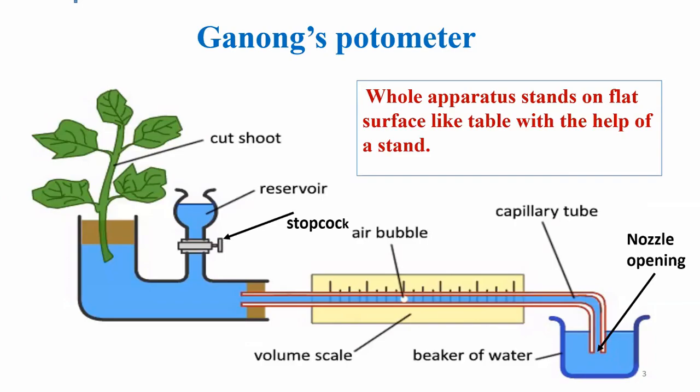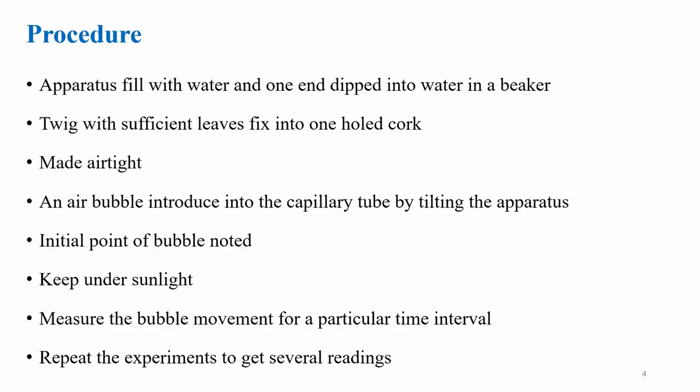Then the Ganong's potometer. Can anybody tell about the Ganong's potometer? How can you do this practical? Any idea? Okay, I'll put up the procedure. First you read and try to understand, then afterwards I will explain. This is the procedure of this practical. Better to read and try to understand, then I will explain.